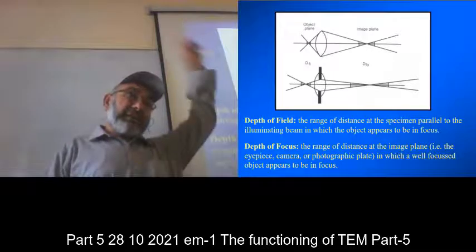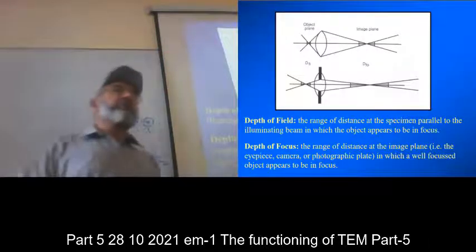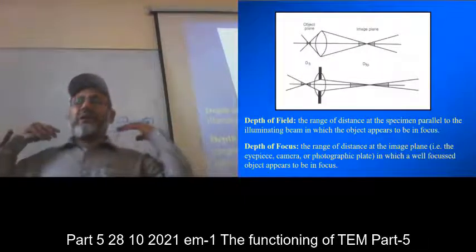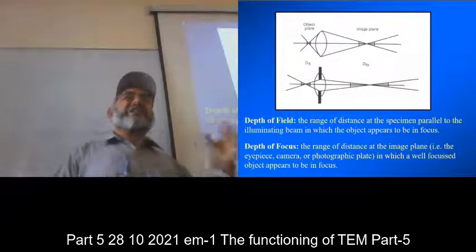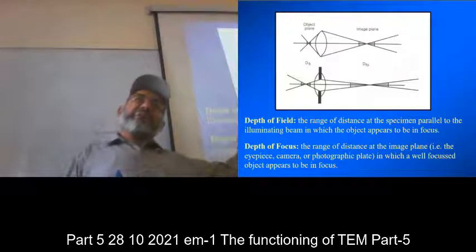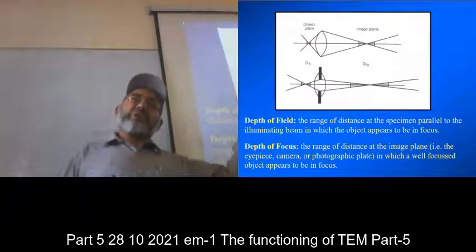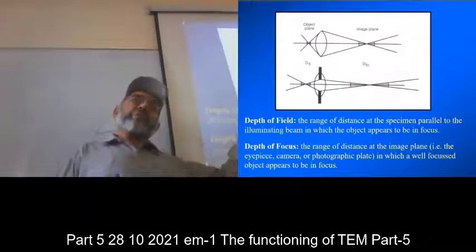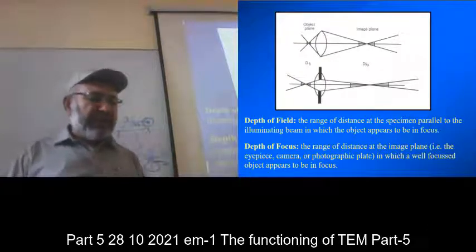And that which I was talking of, phase contrast microscopy, where you see fringes. If you go into high resolution microscopy and further detail, it is called Scherzer defocus, slightly defocusing the beam to enhance the resolution, to make visible the features which are not visible. And why does it come at very high magnification?